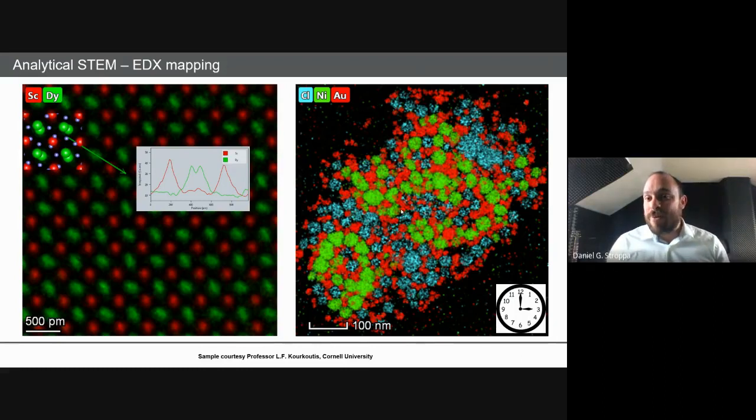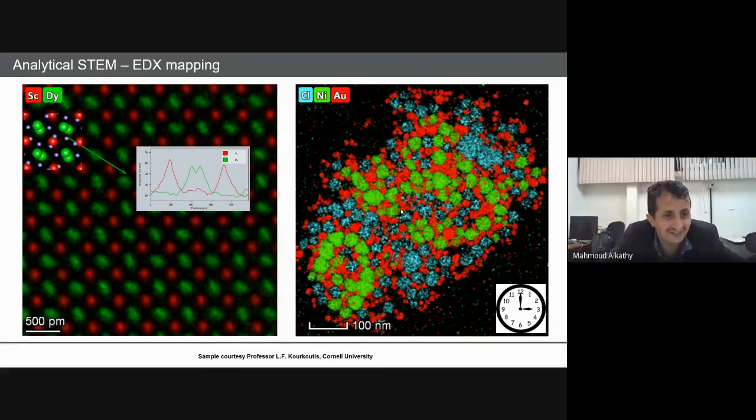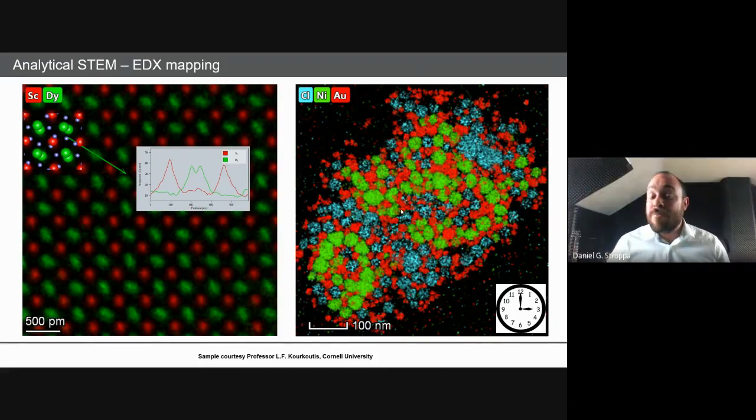And this is a very practical problem. So if you have magnetic samples, you need to think on how to attach them. I have one slide on this later on in the presentation. But then one less dramatic effect is that imagine that you have a sample that behaves like another lens. It's going to deviate the electrons. So you're going to have extra astigmatism. It's going to be a bit more challenging to focus the image and to get high quality. It's going to be somewhat limited.